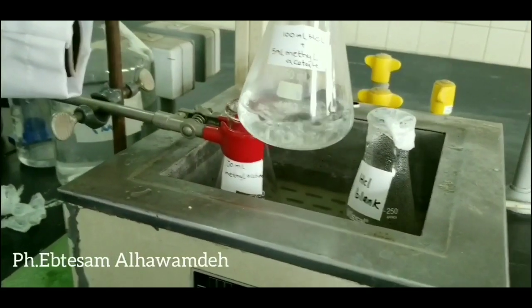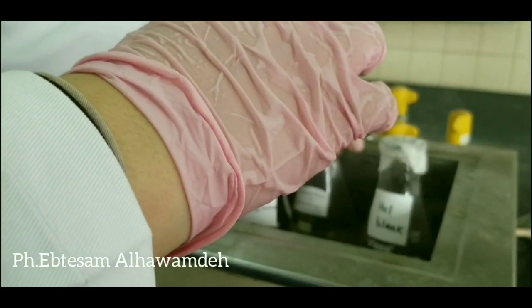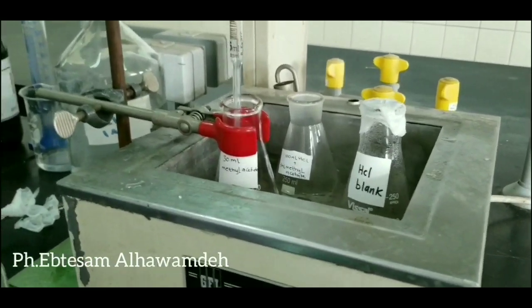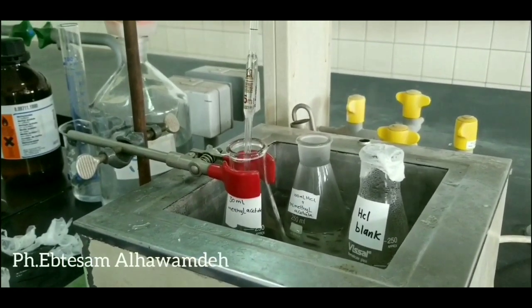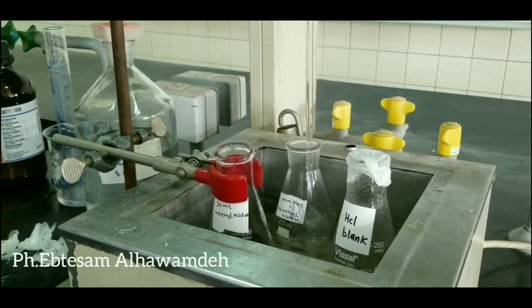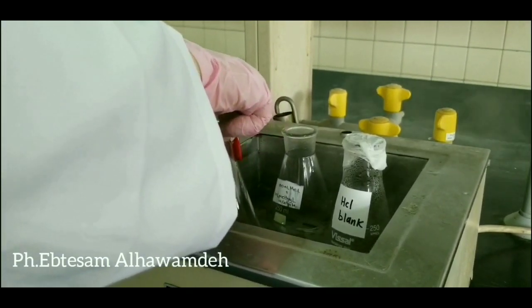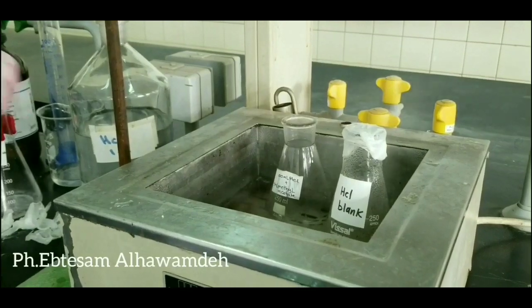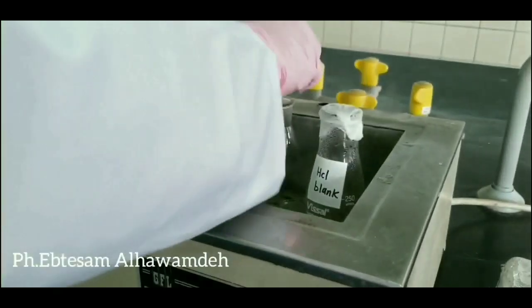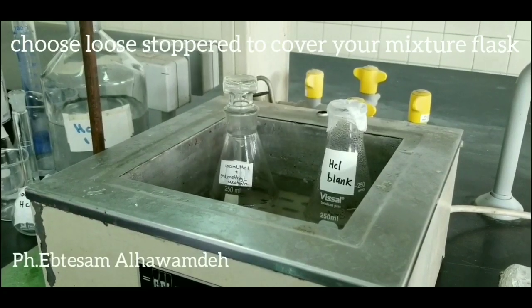Pipette 5 ml of ester into the 100 ml accurately measured acid and record the time of mixing. Loosely stopper the mixture flask to cover it.